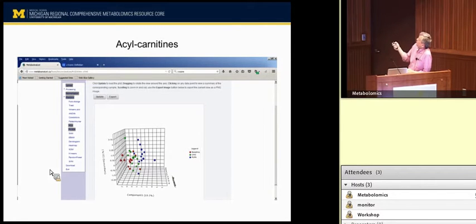Now these actually do separate nicely. So the carbohydrates, the blue and the green, separate really nicely on this. And you can see that at baseline, most of the people are sort of clustering with the carbohydrates. In fact, when we look at a lot of the analysis we've done with these individuals, the people at baseline are eating more carbohydrates than fats. And it turns out that the non-alcoholic fatty liver disease people were eating even more carbohydrates if you start taking a look at it. So this becomes an interesting concept in the way that this might be used to differentiate diets. And I showed you why the 10-1 was probably one of those that drives this separation.